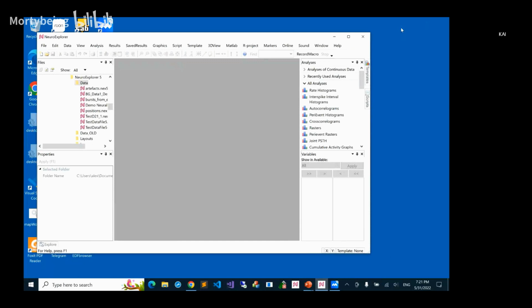I'm not sure, because my current support is for Alpha Map, and I don't know if it worked with your medical equipment. I'm not familiar, so it's a question for your software engineers in Israel. If it's the same protocol as Alpha Map, then probably yes, you can use it. I worked with some neurosurgeons at McGill University in Montreal, but I think they used NeuroExplorer for offline analysis only. So I'm not sure if anybody used it online with the surgery.